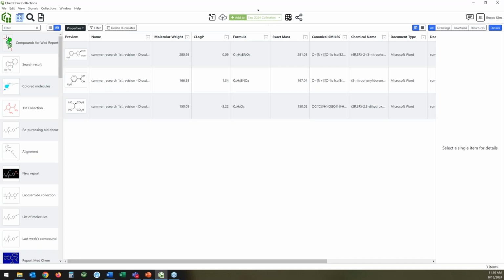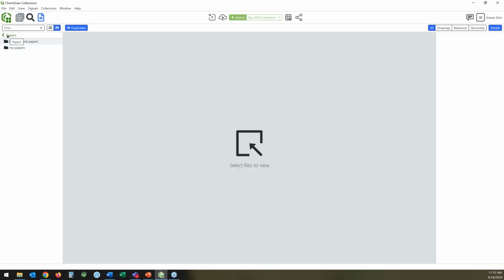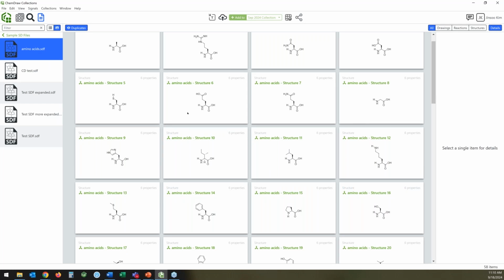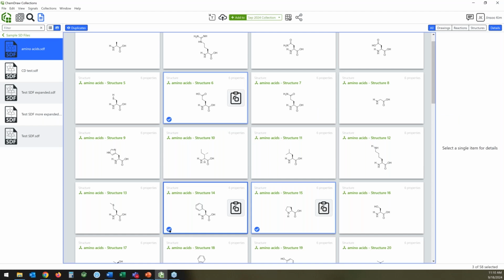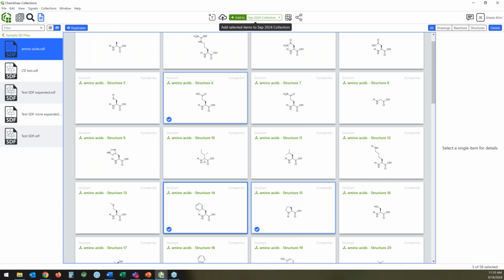One of the other, now that I've created this collection, I can continue to add things. So you say, hey, that was kind of cool, but maybe I've got other things that I want to add, right? So maybe there's an SD file, obviously. Hey, here's something that I might like to add. Oh, cool. There's some other interesting stuff that I might like to pop into that particular file. Here we go. And I can add it to that collection. I can create a brand new collection if I want, but I just say, hey, I want to keep building on that thing that I started earlier, adding items, and then I go into the collections.